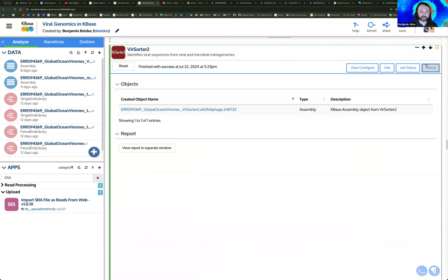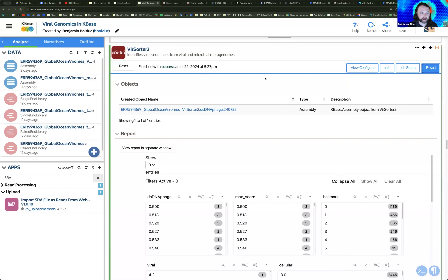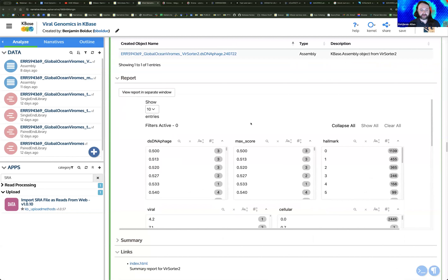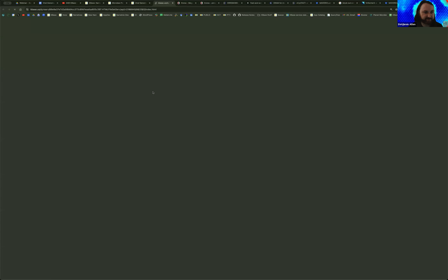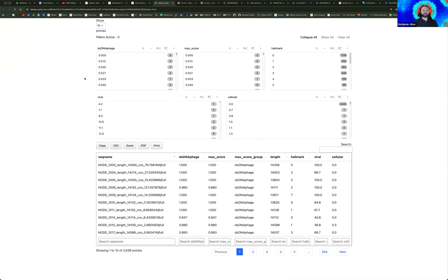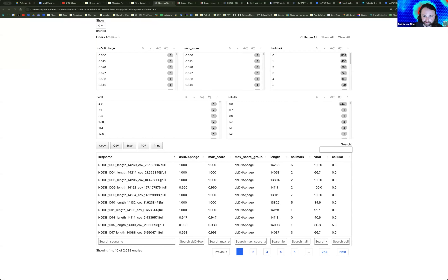This is relevant later on, and we get quite a few support tickets from people trying to run DRAM-V but who have not selected this option on the VirSorter2 app. So just a heads up — make note of that. The output of VirSorter2 gives you a nice report that you can use to explore the viral signatures identified on the contigs in your assembly.